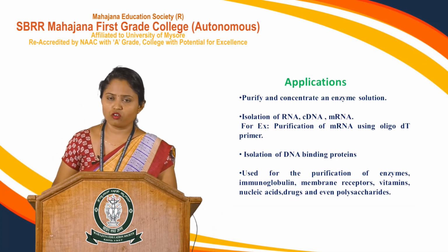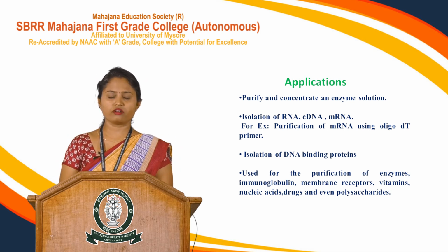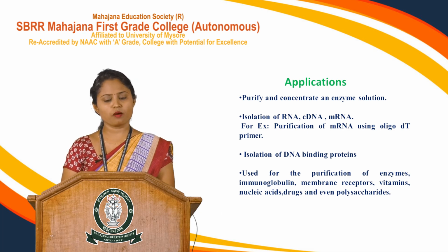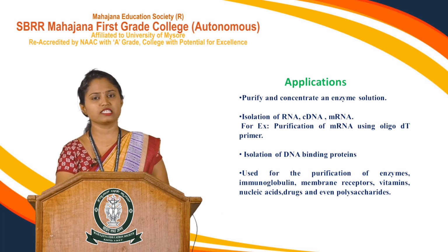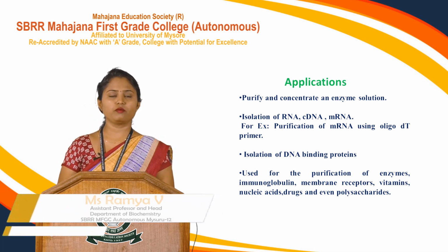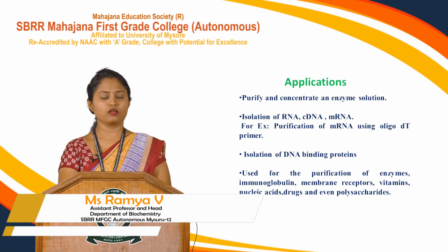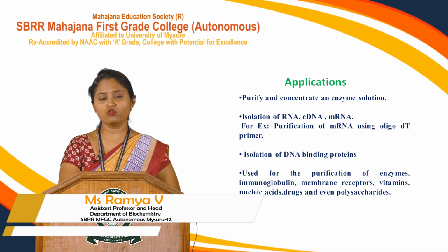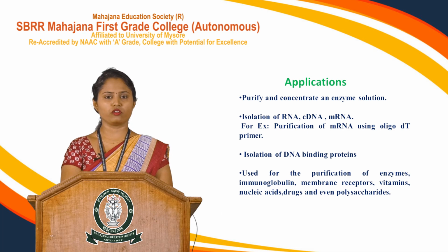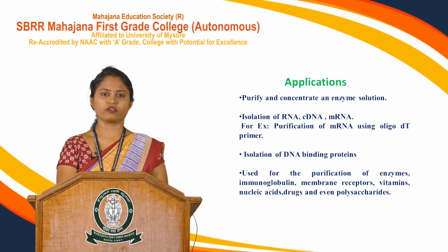Let us focus on some of the applications. As we already discussed, the principle of affinity chromatography separates based on specific interactions. It is also applied for the purification and concentration of enzyme solutions, and you can separate various kinds of RNA, complementary DNA, purification of mRNA, purification of enzymes, immunoglobulins, vitamins, hormones, drugs, and some organic and inorganic molecules. Thus, we complete the principle of affinity chromatography.